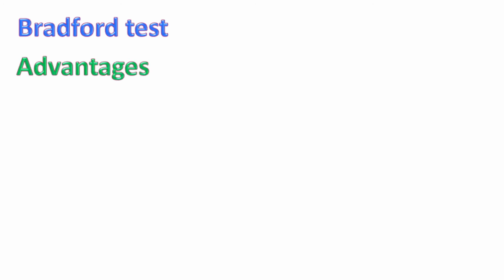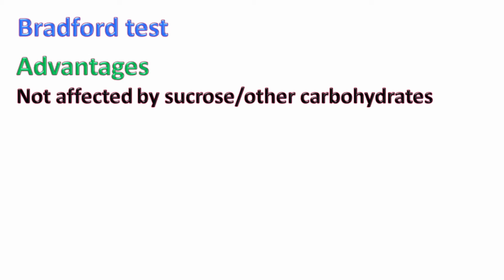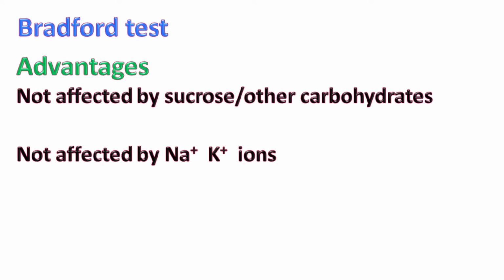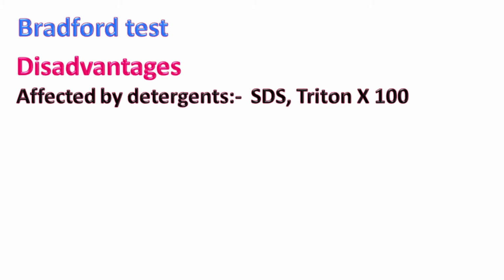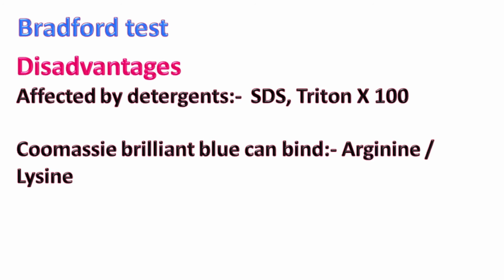The advantage of the Bradford test is that it's not affected by sucrose and other carbohydrates. It's also not affected by the presence of ions like sodium and potassium. The disadvantage of the Bradford test is that it's affected by the presence of detergent. Also, the dye can non-specifically bind with amino acids like arginine and lysine.